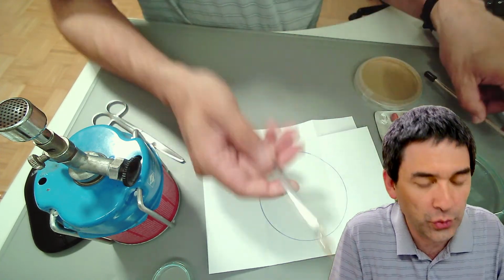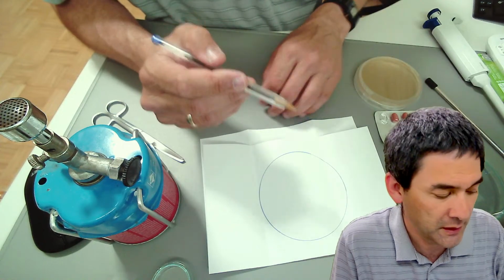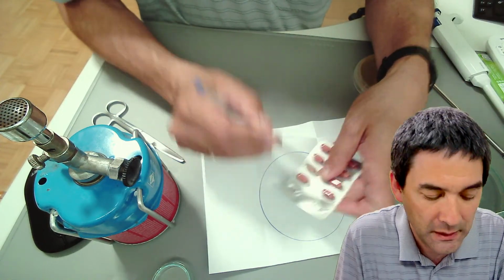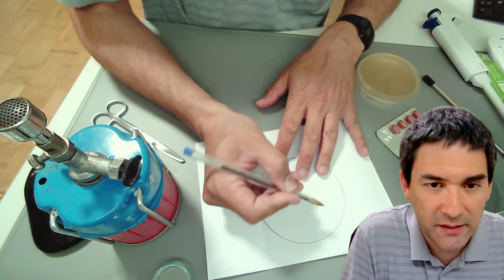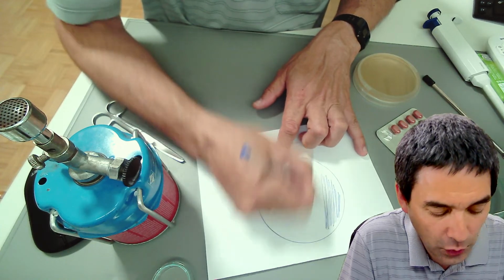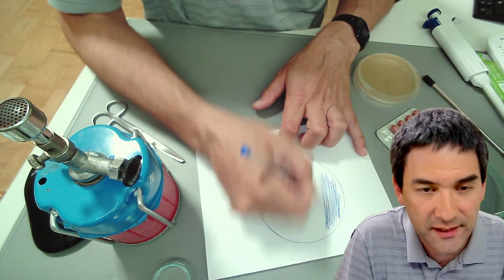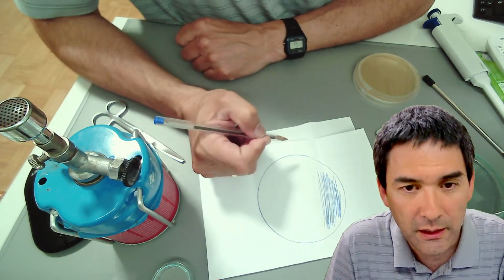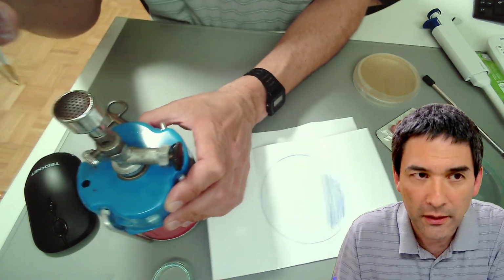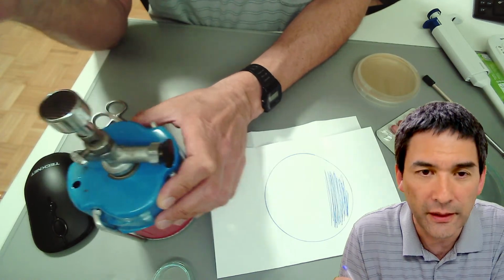I'm going to show you now, using a pen, what I'm doing. I'm going to dip the inoculation loop into the bacteria and take a small sample, and I'm going to spread the bacteria on the agar like this. And then I'm going to hold the loop into the flame to kill off all of the bacteria.